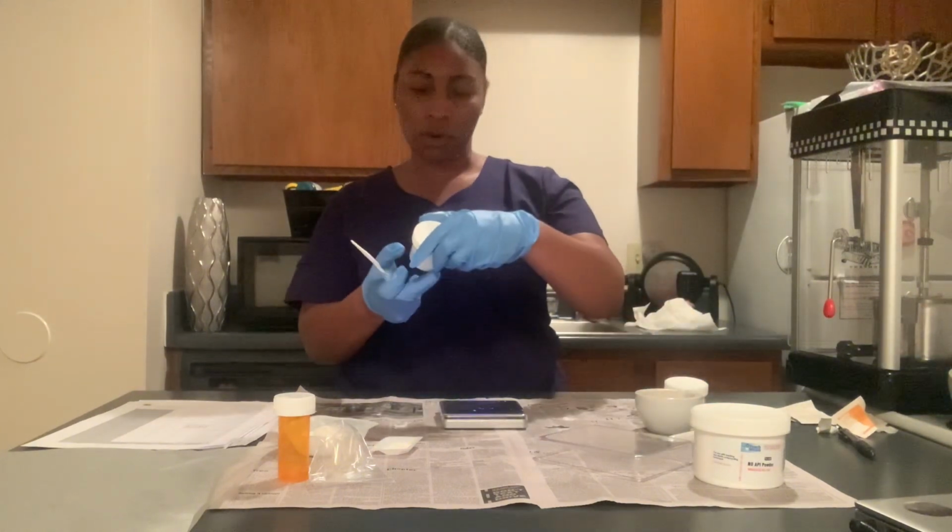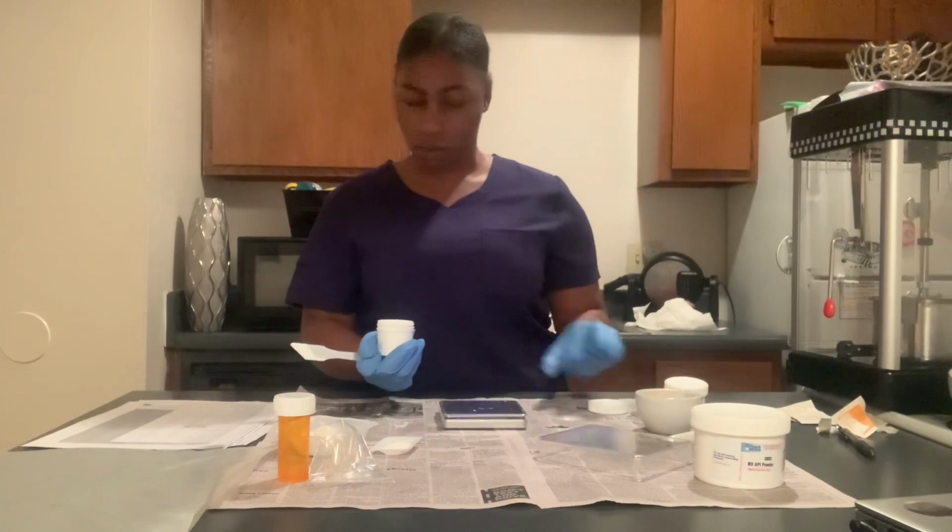And now it's our ergotamine powder, which is also 1 gram.